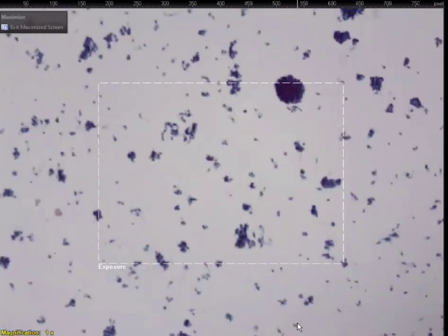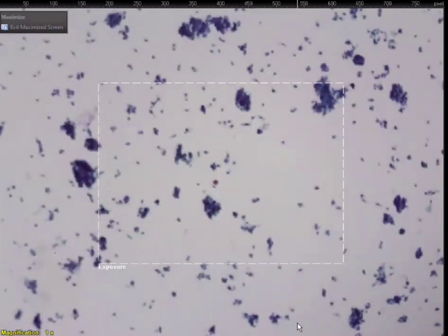Okay, very good. So we're comfortable. This is PTC, metastatic. Yeah, very good. Excellent. We'll do one more now, seeing as we are on a roll.